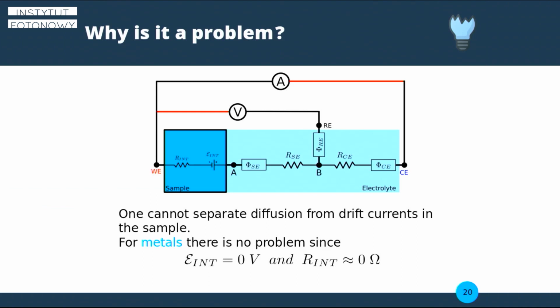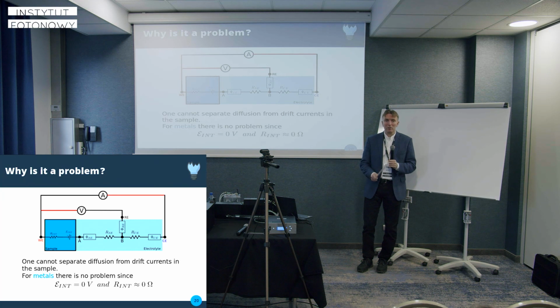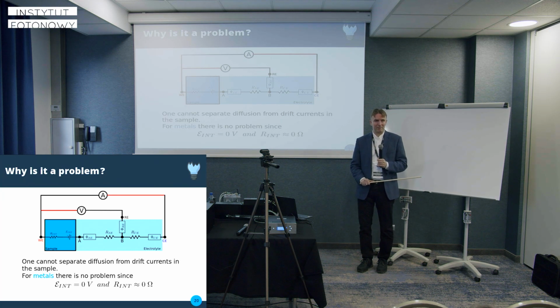But some assumptions behind the measurements that we are doing every day are such that it is not a foolproof system, and it is not even self-consistent. However, if you do measure metals, there is no problem. Okay?